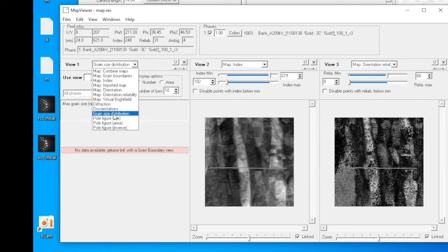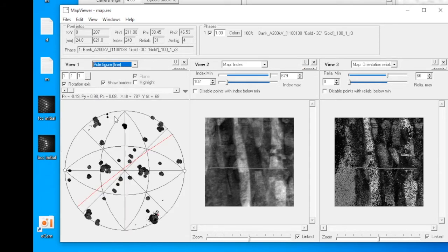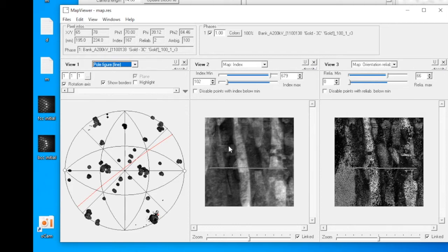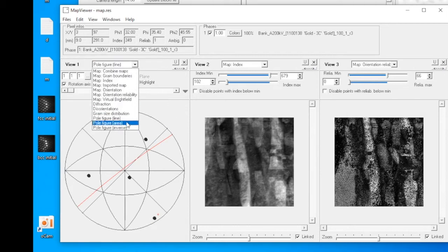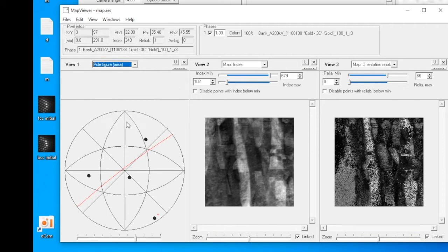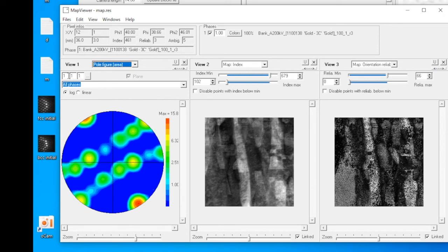For the grain size distribution, I haven't really used it myself. You can give it a try if you're interested in this option. Next is pole figure. You can generate pole figure of the entire microstructure. You can also generate the pole figure of individual pixels. In the next pole figure option, you can generate a contour map very similar to what you can do with EBSD and XRD.